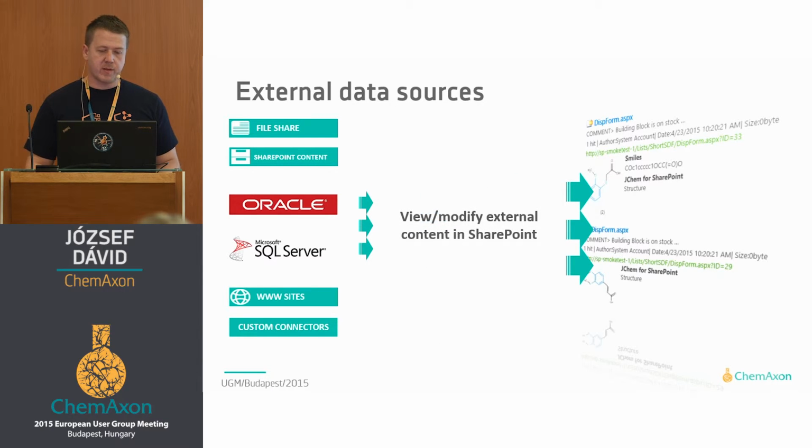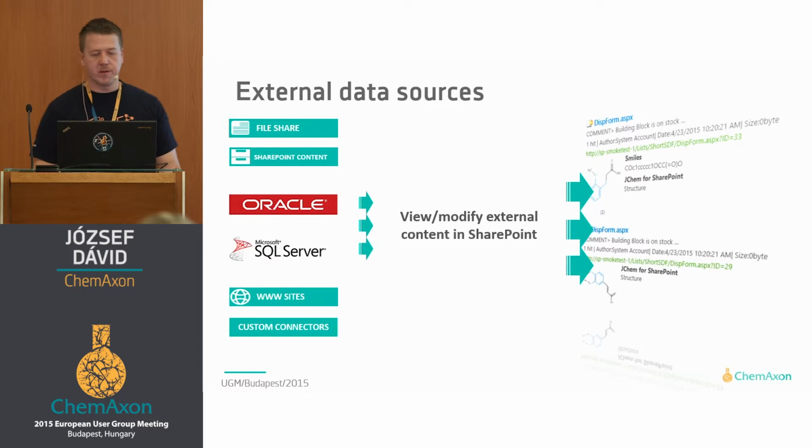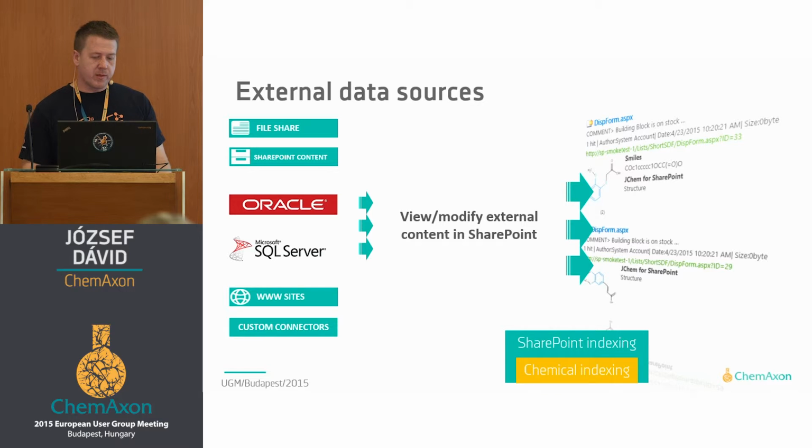Some of those data can even be modified within SharePoint. Some of them can just be viewed, and some of them only play a role in the indexing and searching later. Then the SharePoint indexing together with the chemical indexing will present you a nice result layout for your searches.